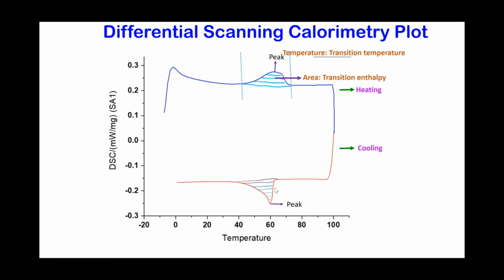The possibility of determining the transition temperature and enthalpy makes DSC a crucial technique for studying various phase diagrams of chemical systems. Under certain conditions, the area under the peak is associated proportionally with the heat evolved in the reaction. So now we will move to the demonstration part of differential scanning calorimetry for our better understanding.